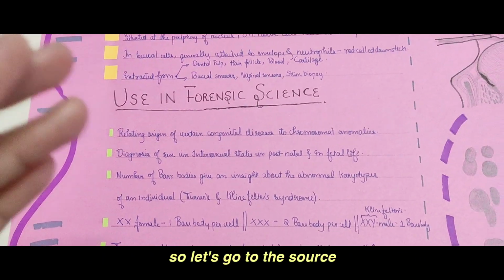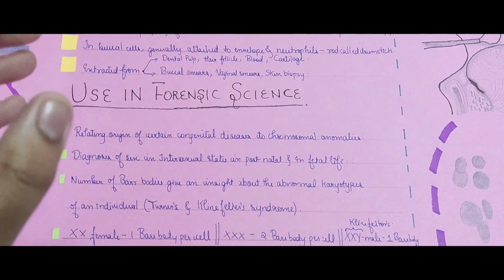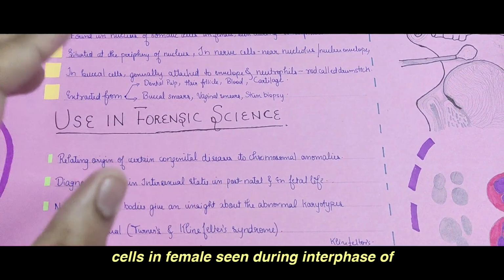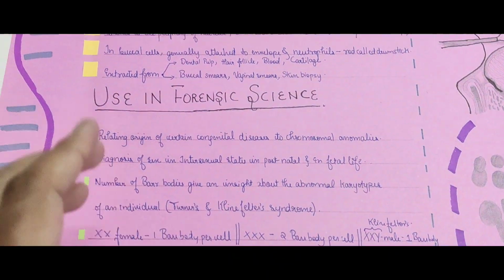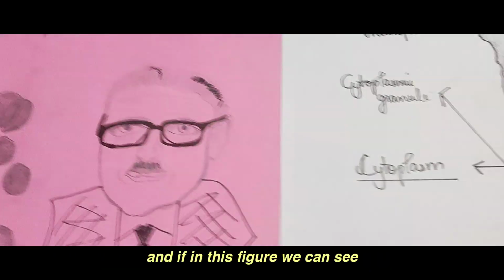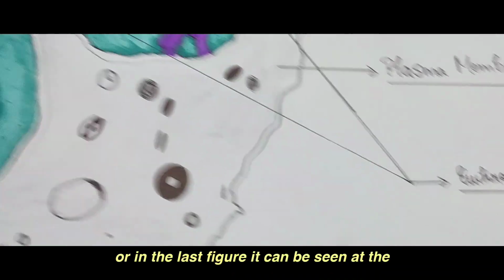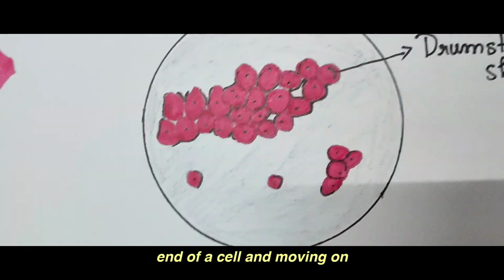So let's go to the source where we get the Barr bodies. Barr bodies are found in the nucleus of somatic cells in females, seen during interphase of the cell division, and situated at the periphery of the nucleus. In this figure we can see that sometimes it can be here, or in the last figure it can be seen at the end of a cell.